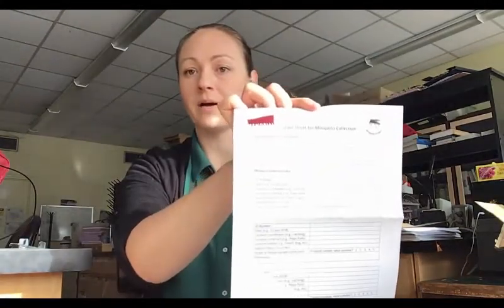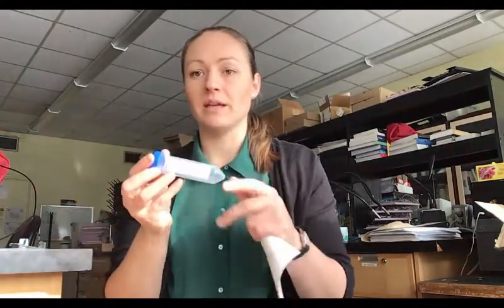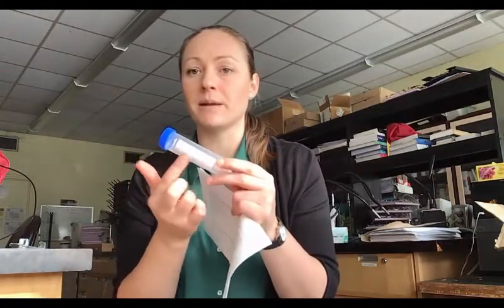That package will have a few different things in it. One is information on the project with contact information and instructions on the other side. The other sheet is your data sheet where you'll put all the information about where you collected, what the habitat was, that kind of stuff. This will correspond to the information you write on the collection tube label here.